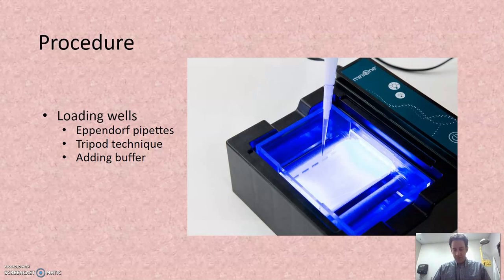Then you're going to transfer the gel to your gel electrophoresis chamber. You're going to have a device that looks like this, and inside, whoops, that fell. This is where the actual tray goes, where the gel goes. There's this black piece at the bottom that falls out, and there's little lines where the wells go. And so you're simply going to take that tray.